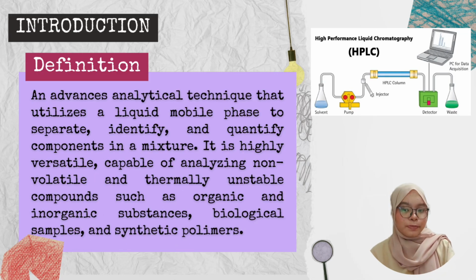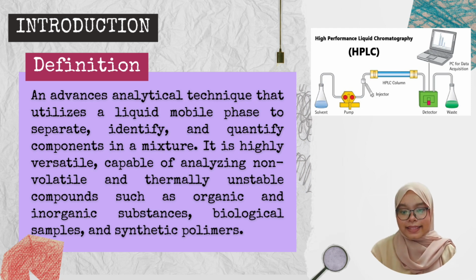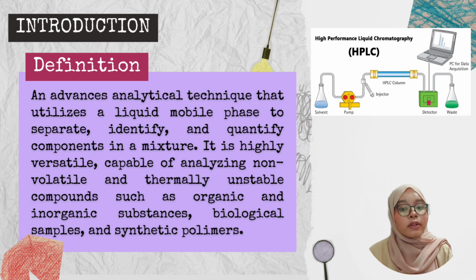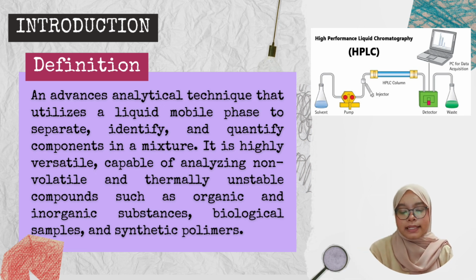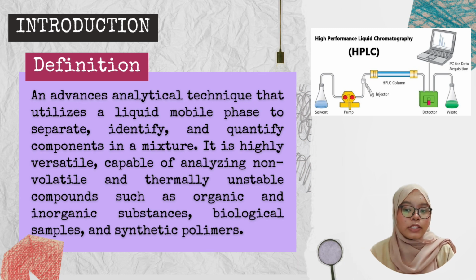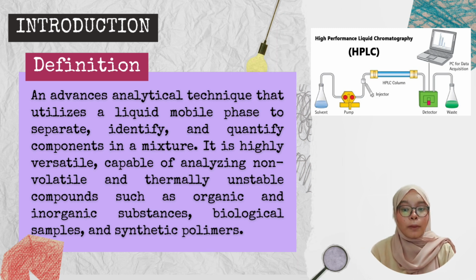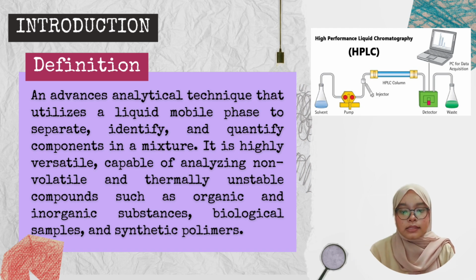Definition of HPLC. HPLC is an advanced analytical technique that utilizes a liquid mobile phase to separate, identify, and quantify components in a mixture. It is highly versatile, capable of analyzing non-volatile and thermally unstable compounds such as organic and inorganic substances, biological samples, and synthetic polymers.